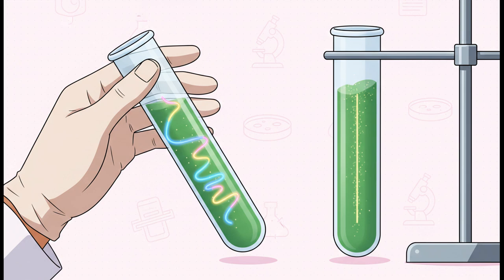The agar slant is just what it sounds like. It's cooled at an angle to create a bigger surface area for storing and maintaining pure cultures. The agar deep, on the other hand, is solidified standing straight up, creating this column of media that serves a totally different and really clever purpose.